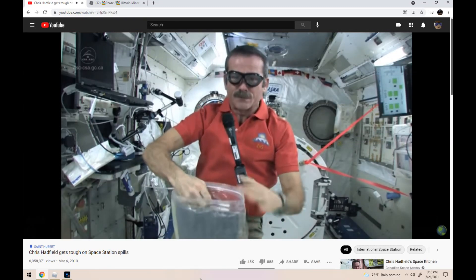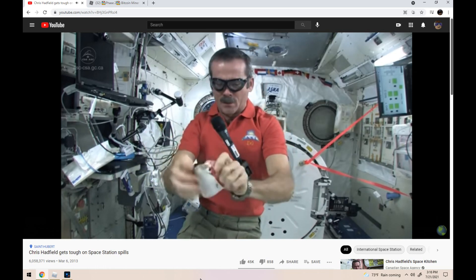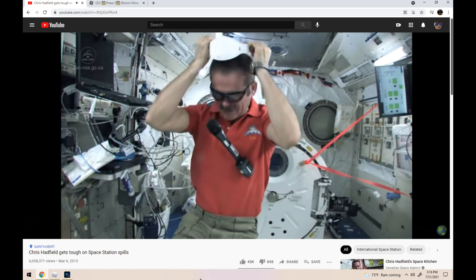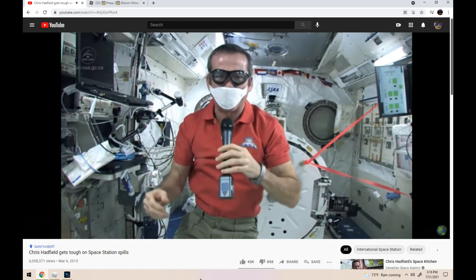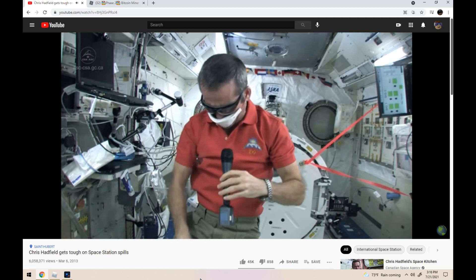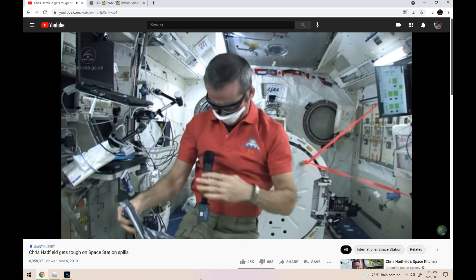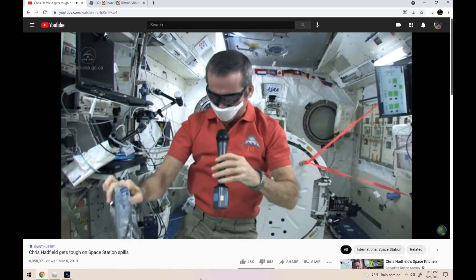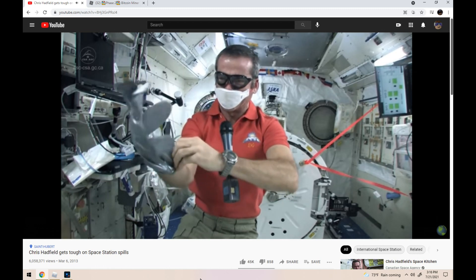You want to protect your mucous membranes and your lungs, so we put on a mask — trying not to break it. Now I have my mask and my goggles on. And then we want to protect our hands. We have special gloves that protect us against chemicals. They're called silver shield gloves. So I put on my silver shield glove.